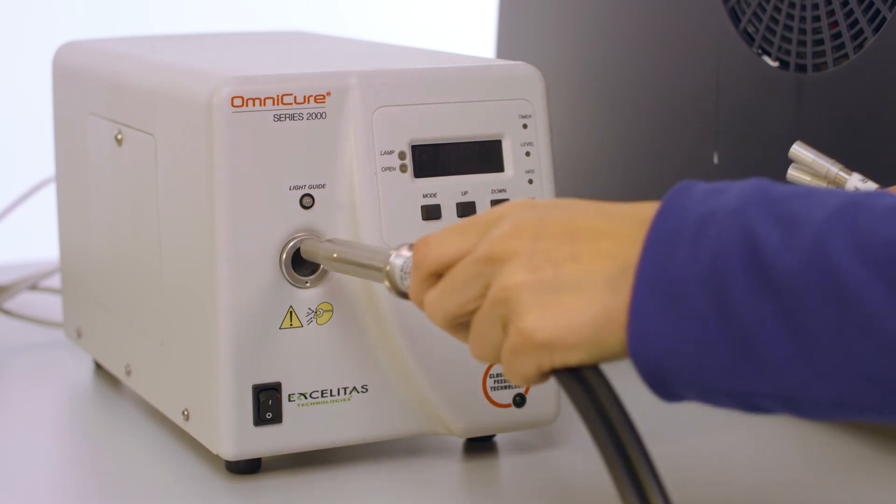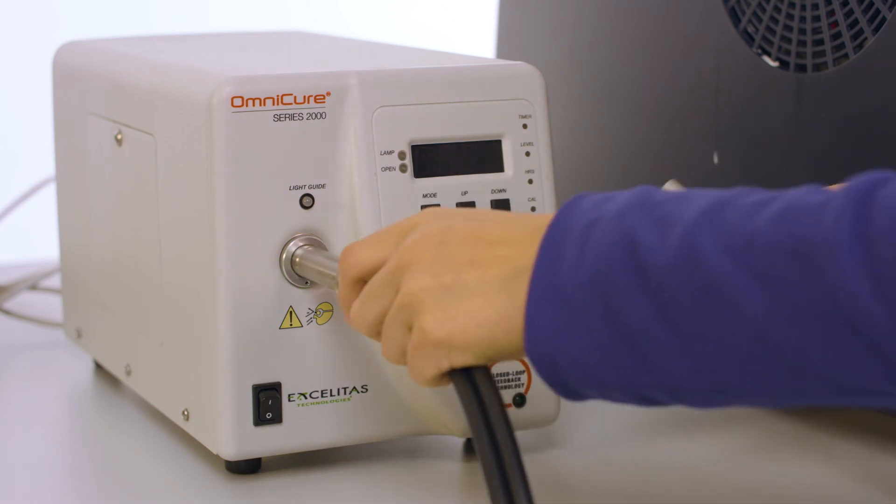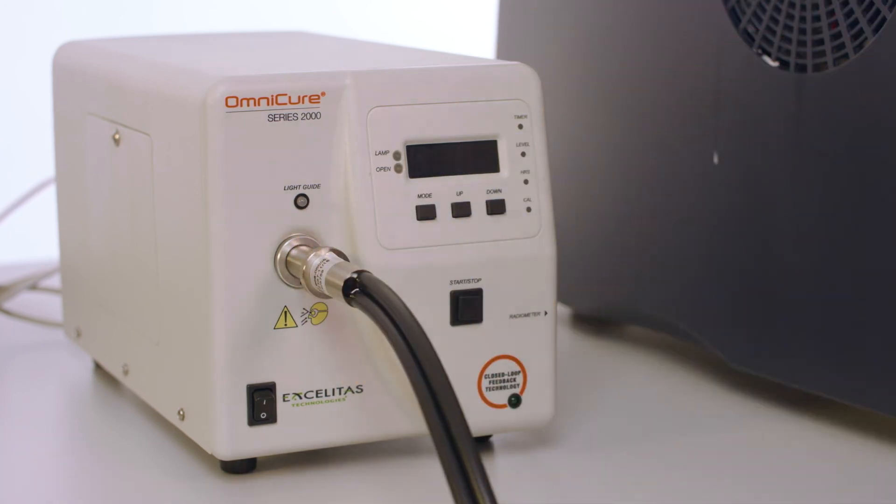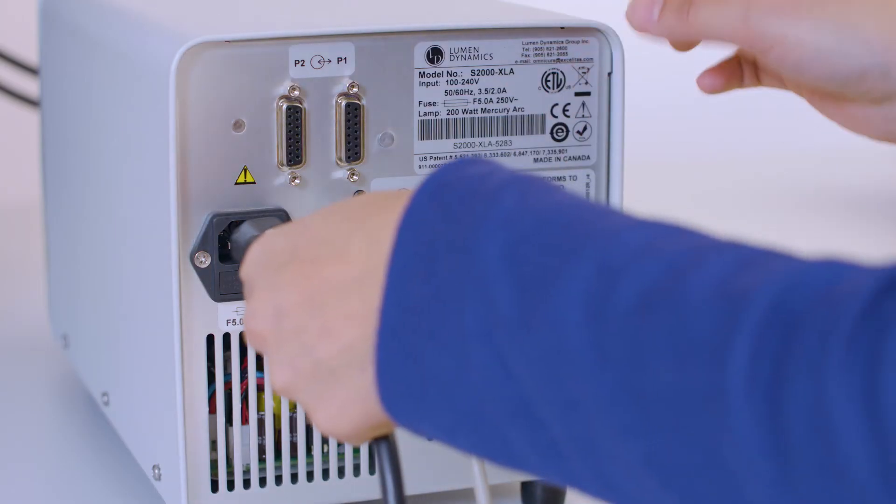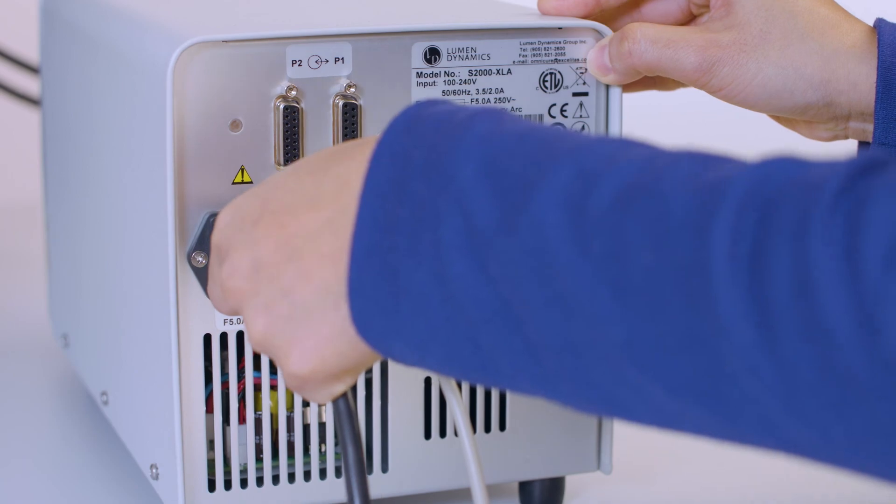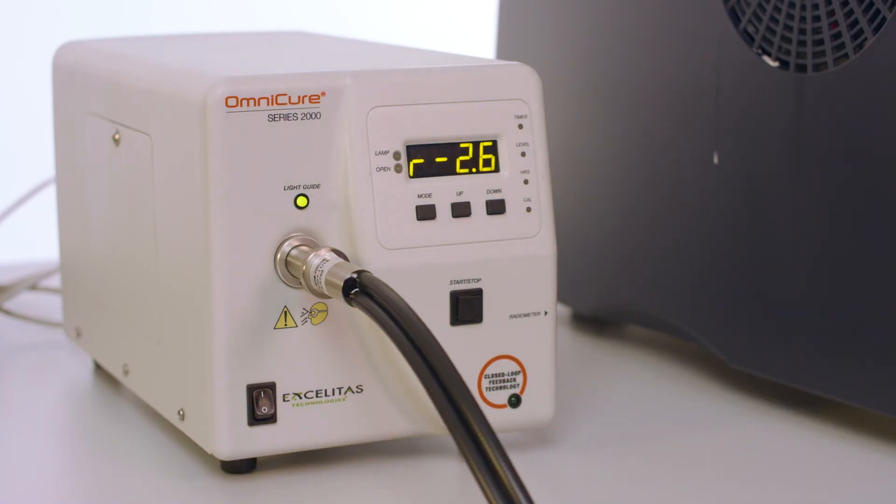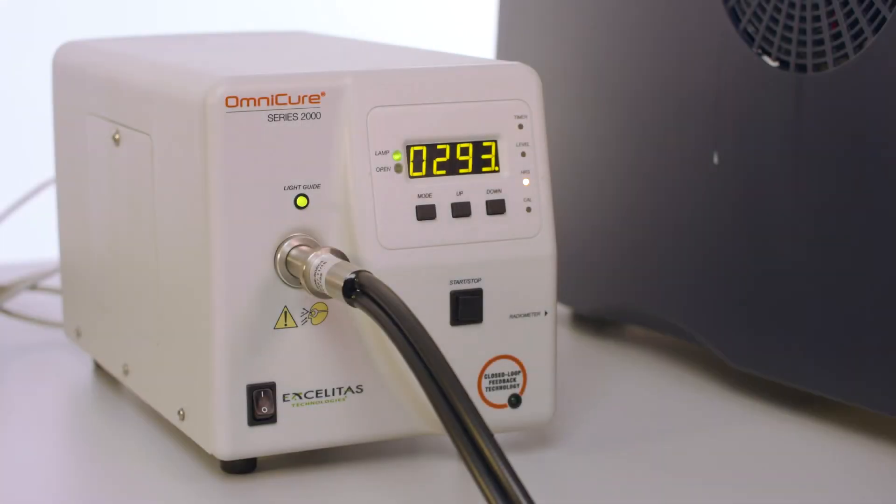Insert the light guide into the light guide port on the left side of the PCA unit until it clicks. Plug the PCA power cord to the back of the PCA unit. Turn on the UV lamp and allow it to warm up. The LED will stop flashing when it's ready for operation.